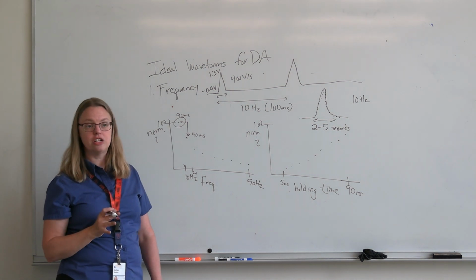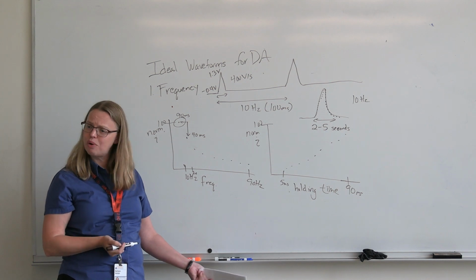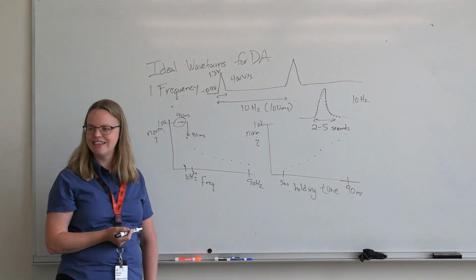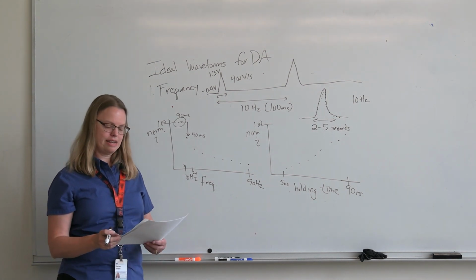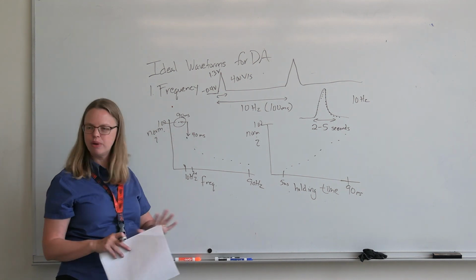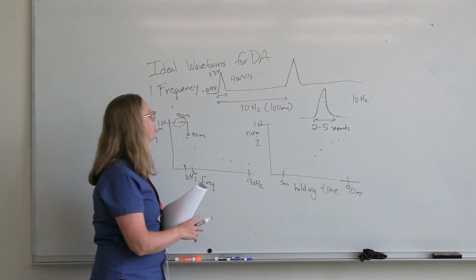And that's good. We want to go fast enough that we can define the temporal dynamics of what we're looking at, but slow enough that we actually get signal. And again, there are some special electrode designs that are going to take some of this off. But people have basically decided that 10 hertz is a good enough sampling rate for what they actually want to see in the brain.